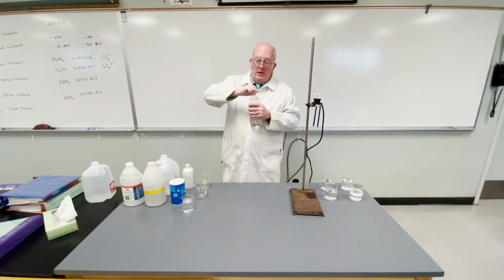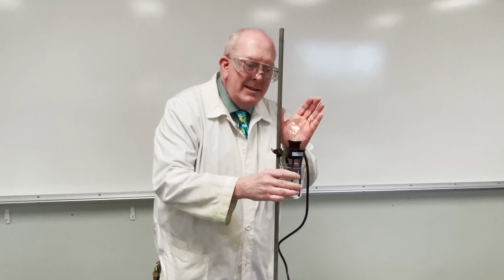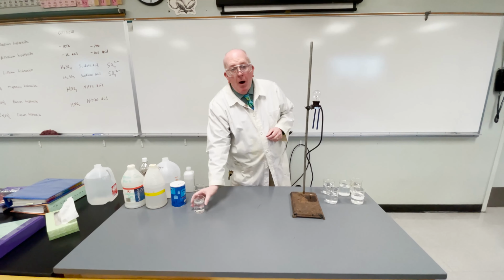So, take this, put it there. Now, you gotta look at the bulb. It is glowing slightly, not a lot, okay? It's conducting, but it's conducting poorly. Now, the reason that that's happening is because the vinegar is not considered a strong acid. The acidic component, which is called acetic acid, is a weak electrolyte which only partially dissociates.